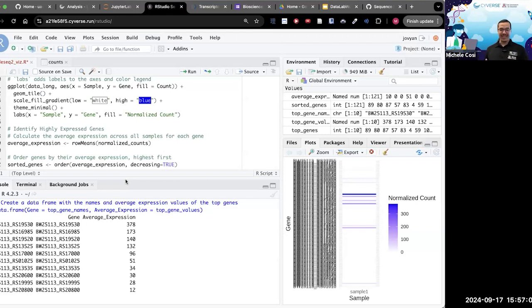So y'all, thank you very much for today. This was an introduction to what it feels like to create an assembly, actually using the tools that we talked about last week, and use some real world data to do some really high level analysis.